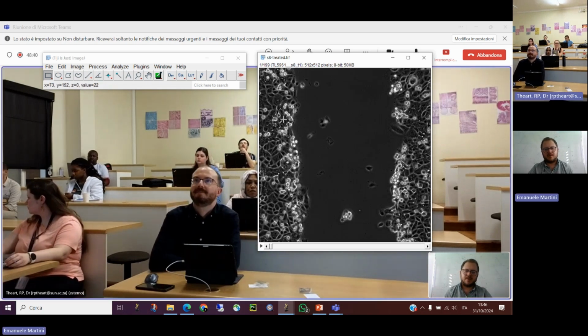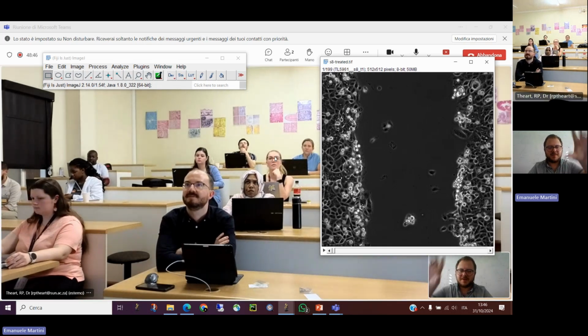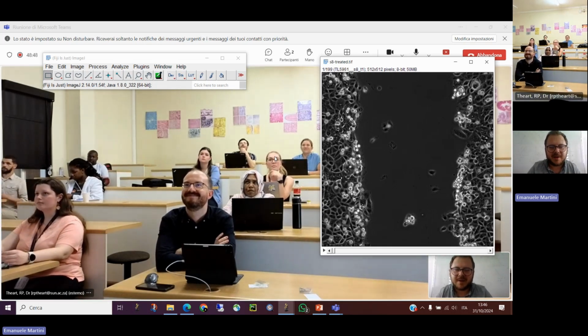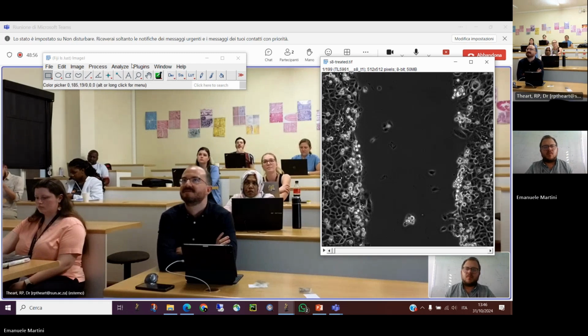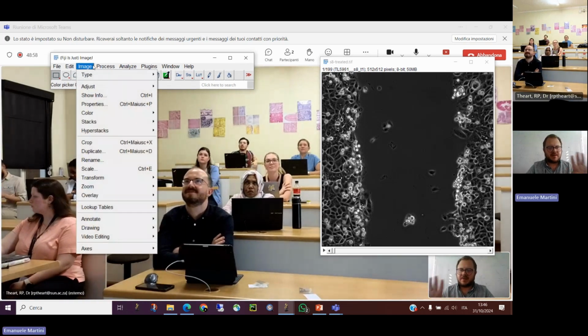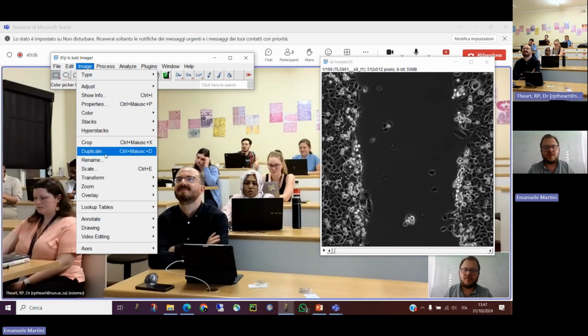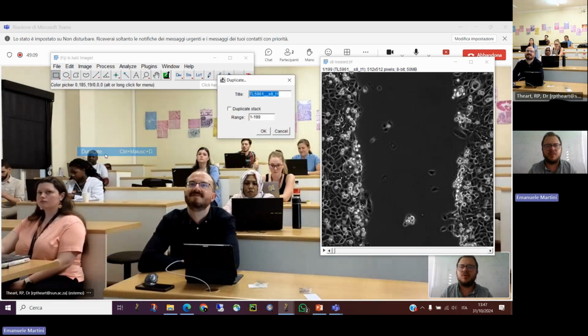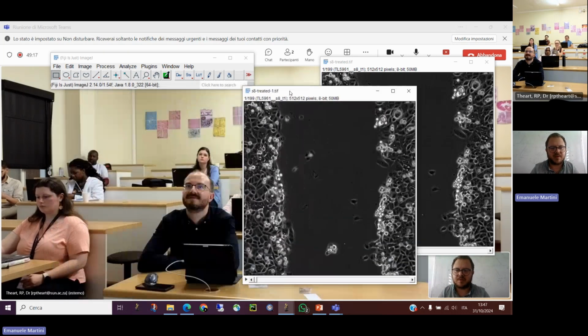Okay, so from here, what we have to do, as I don't know the name of that girl, but as she said, we want to find a way to identify the cell layers. First of all, as always, sorry, I always forget this, but when you start a new workflow, a new analysis, and you want to do test and trial, it's better to duplicate your image. So you don't need every time to reopen your image. So first thing maybe you can do is just duplicate the image so you can do some tests here.